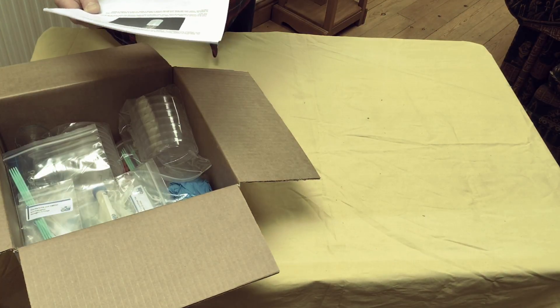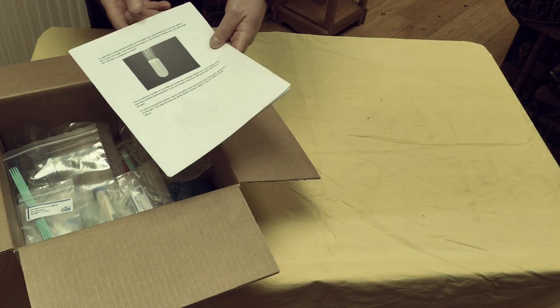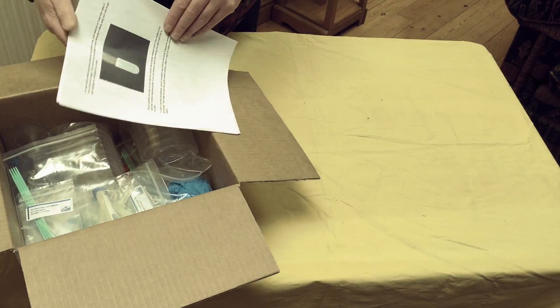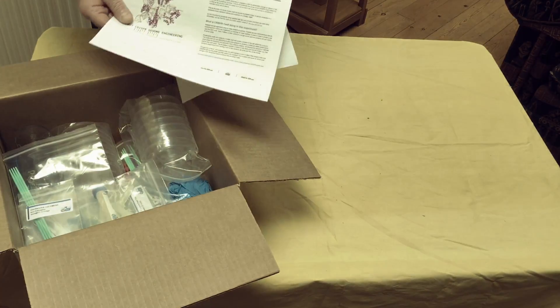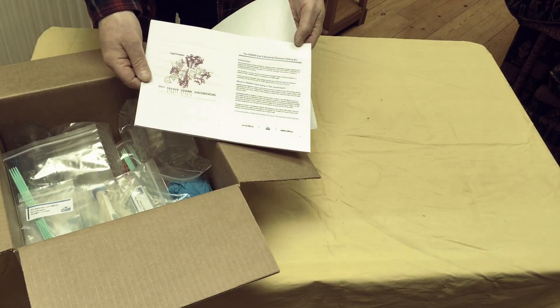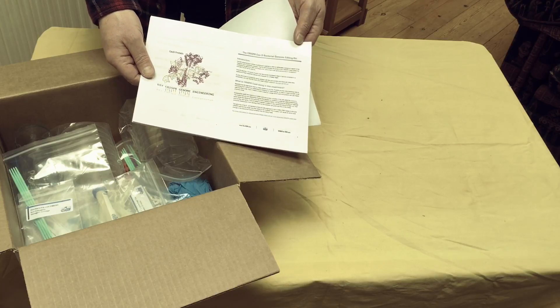Then here there seems to be some instructions. The kit contains enough for doing a particular sample experiment, so I presume this is what this is. These are the instructions for the sample experiment.